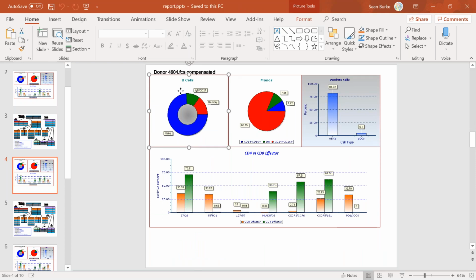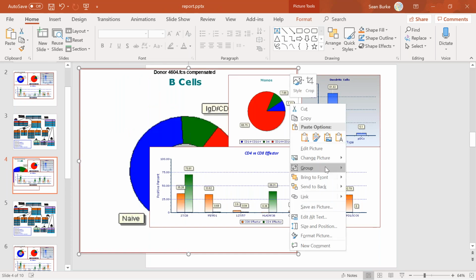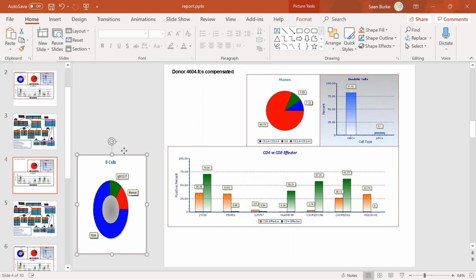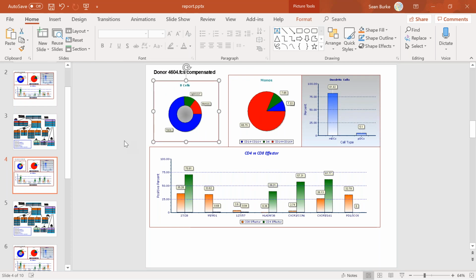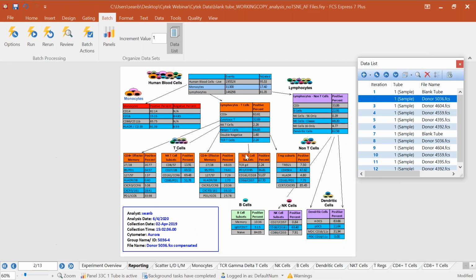So we have the report and we have the graphic report, 10 slides, 2 slides for each of the data files. And the really cool thing about FCS Express is these PowerPoint exports are all individual, what's called vector graphics. So if I wanted to group them and ungroup them and bring them to the front and move them to the back, if all I needed was this B-cell distribution for my poster at Cyto, you have all of that here, right? And that's a result as well, being able to take your data, share it with the community at a conference or poster presentation or publication. FCS Express really helps facilitate getting these results quickly and easily, either through using classical panels, through doing these kind of batch exports. It's all there and pretty accessible. And again, if you know how to use Office, if you know how to use PowerPoint, you're already halfway an expert.